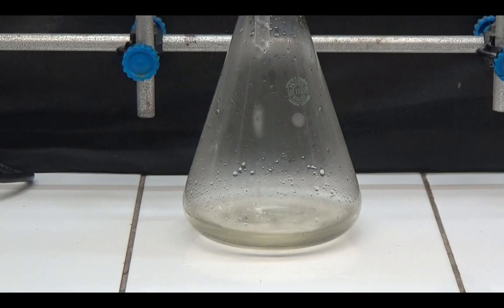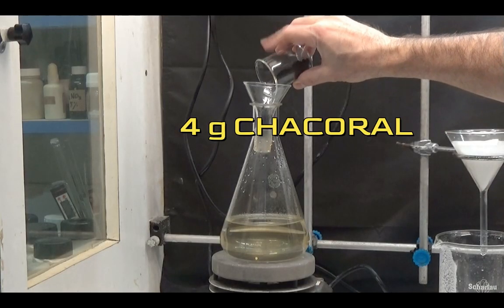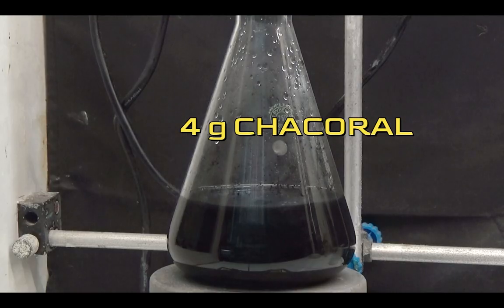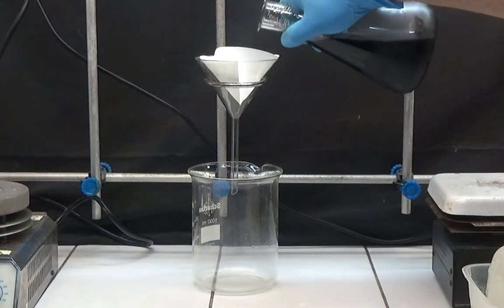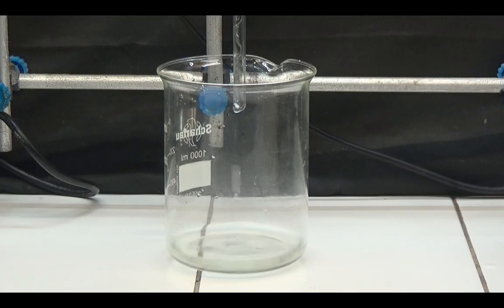We put the filtrate in an Erlenmeyer flask and add 4g of charcoal. We heat it to a boil for 20 minutes. We filter to remove the charcoal, and the solution should be transparent and colorless.